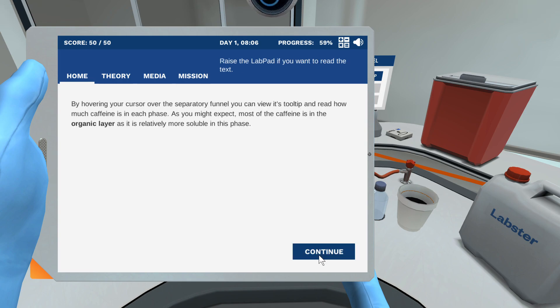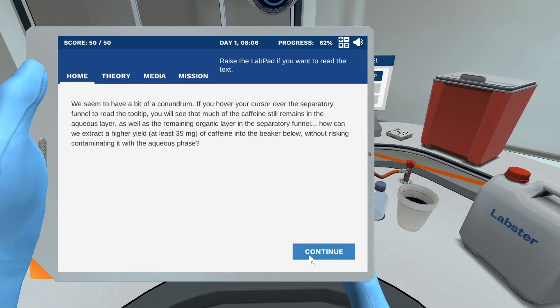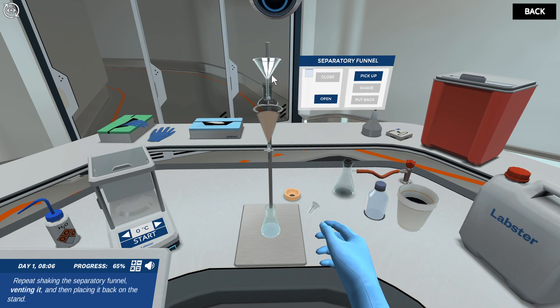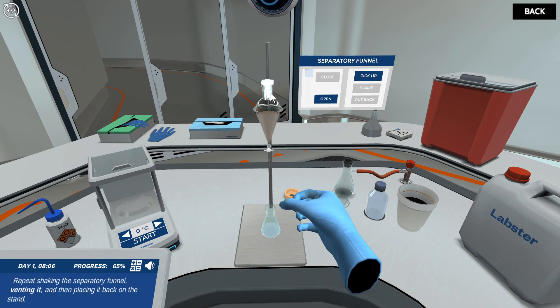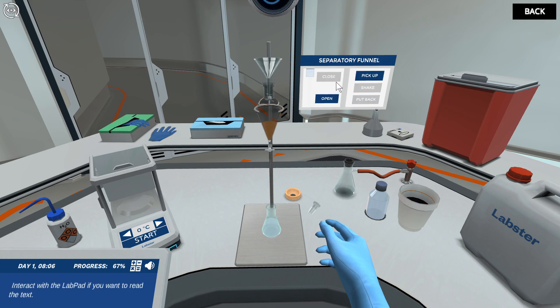Use the slider to carefully open the valve and collect most of the organic phase. Pour more dichloromethane into the separatory funnel. Repeat shaking the separatory funnel, venting it, and then placing it back on the stand. Remember to open and close the stopcock to vent it, then use the slider to carefully collect most of the organic phase into the empty flask.